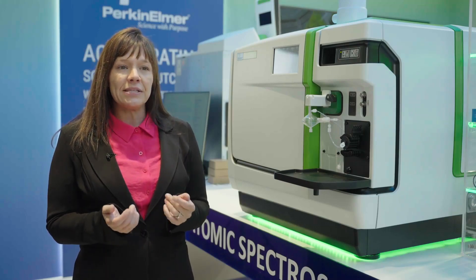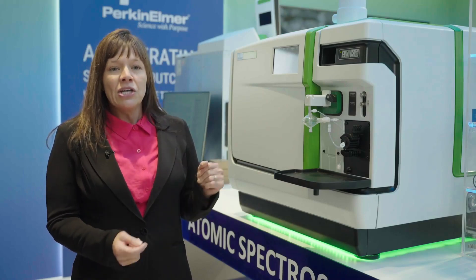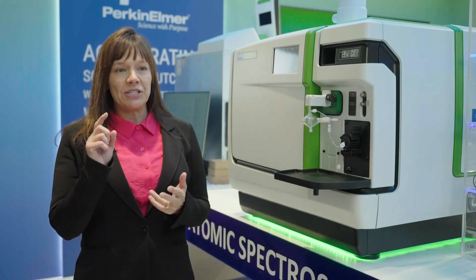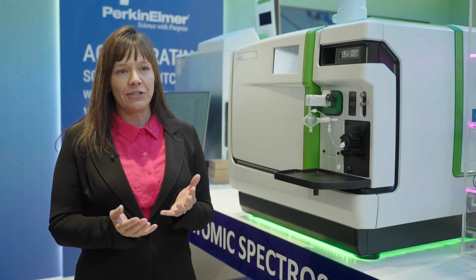Our analysts today are not only running an ICP-MS — they could be running an AA or a GC. So being able to have training videos just a click away is a really efficient way to make sure that our analysts stay trained.